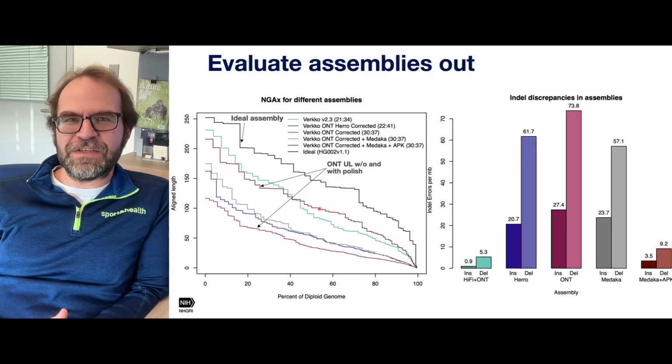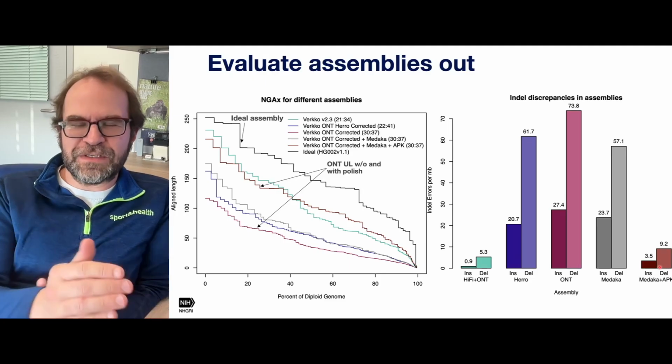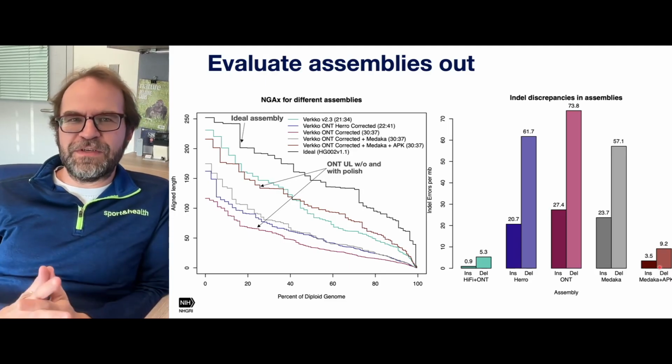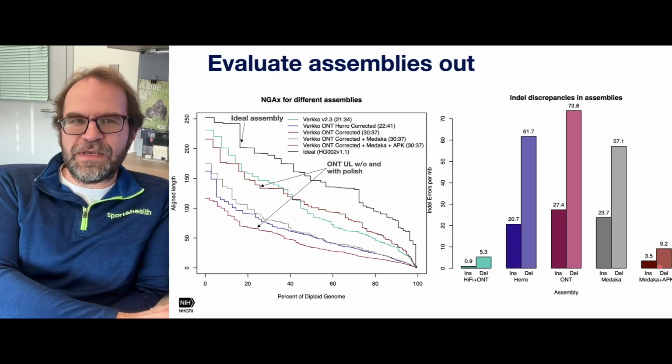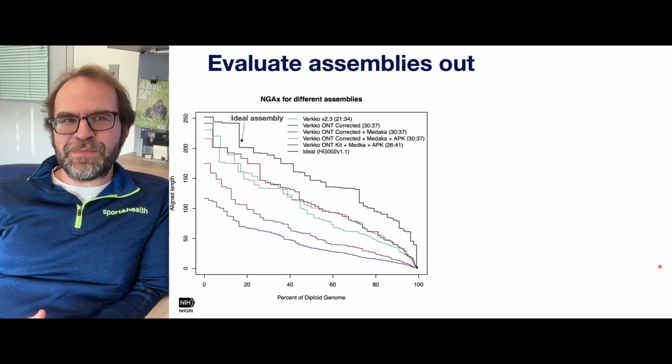And when we look at the insertion and deletion rate, we again can see this assembly with polishing is almost comparable, a little bit worse, but pretty similar to the hi-fi based one. But obviously, we don't want to just match our current recipe. We want to do better.